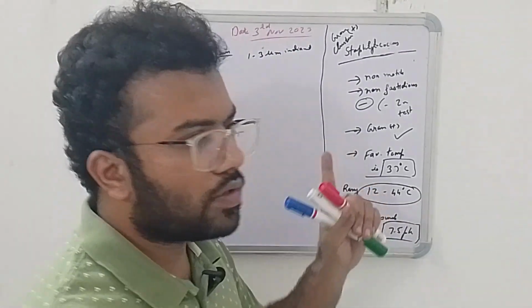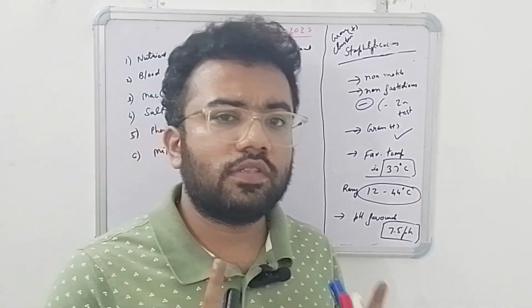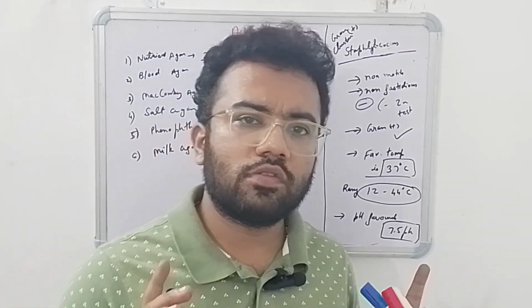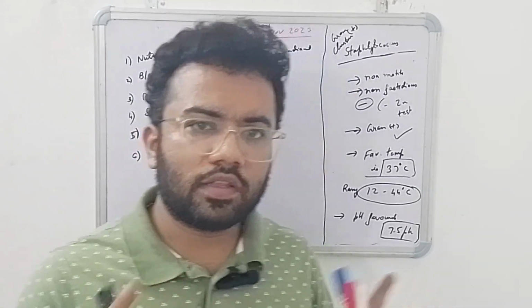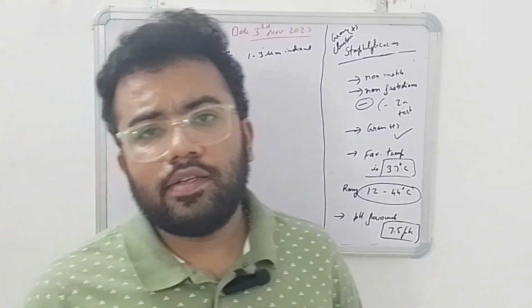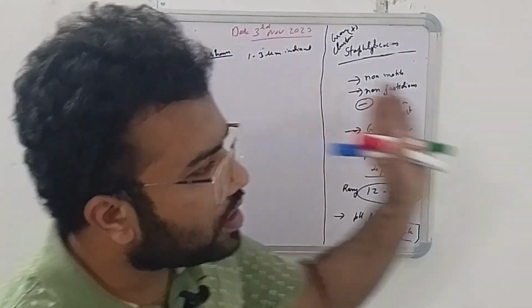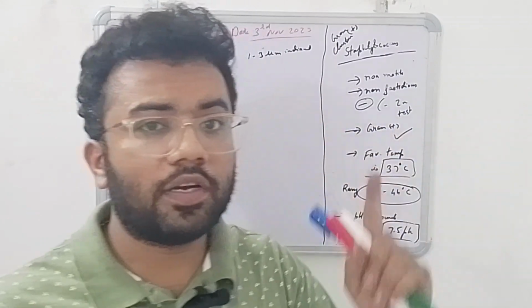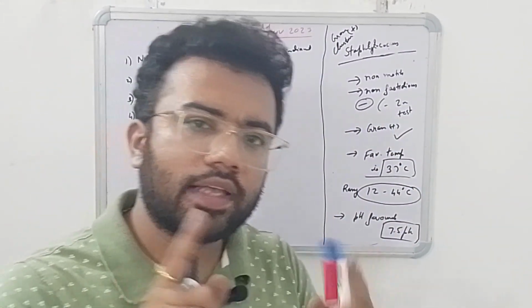We also know that mannitol fermentation is seen in Staphylococcus aureus species only, not in S. epidermidis or S. saprophyticus. Okay, so in Staphylococcus aureus fermentation of mannitol, there will be no production of gas, only acid.